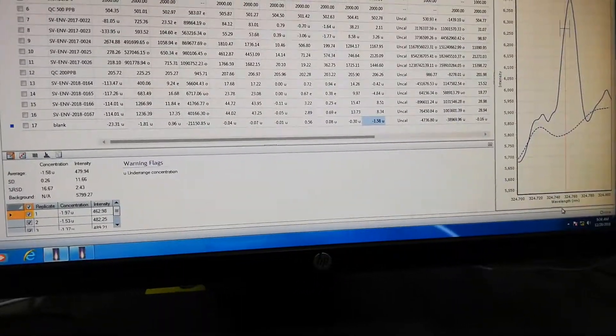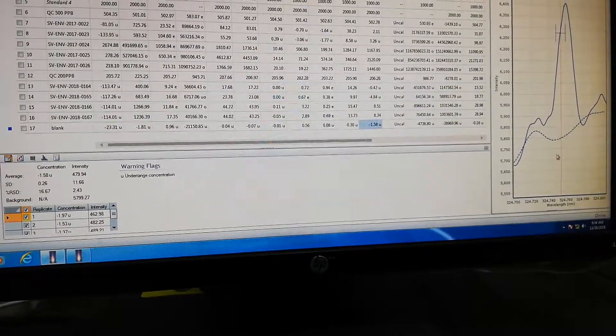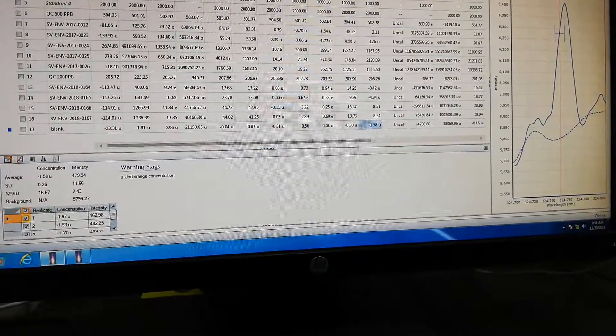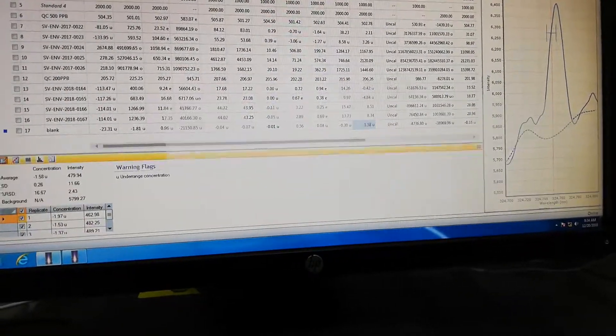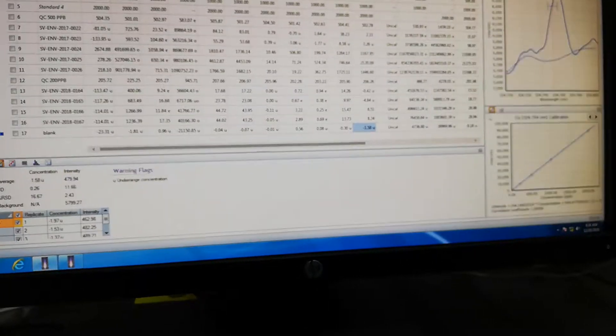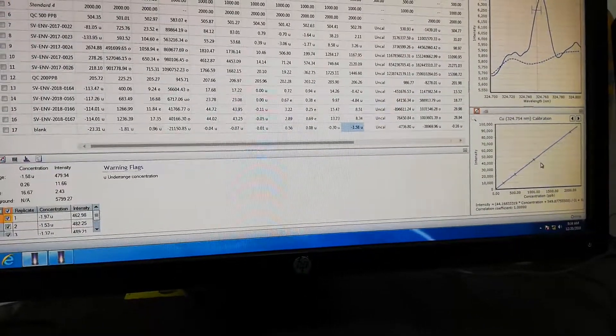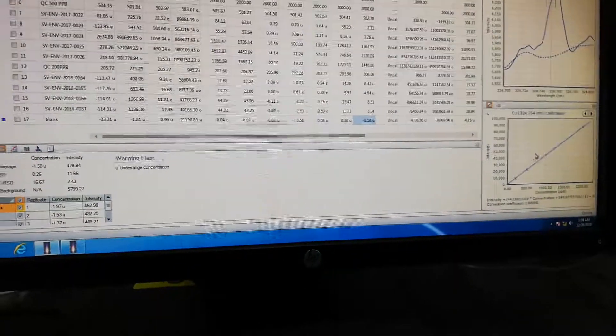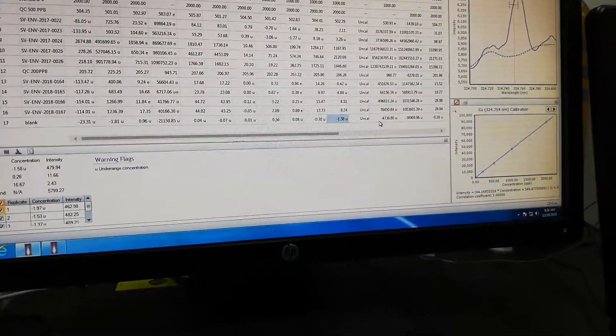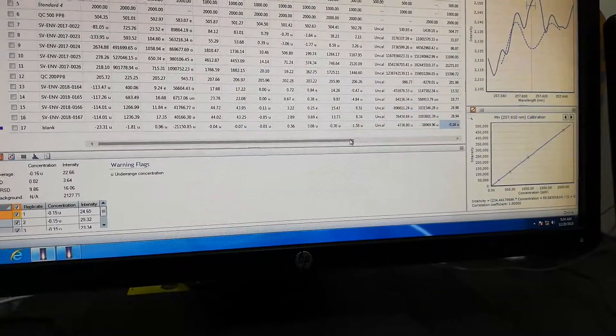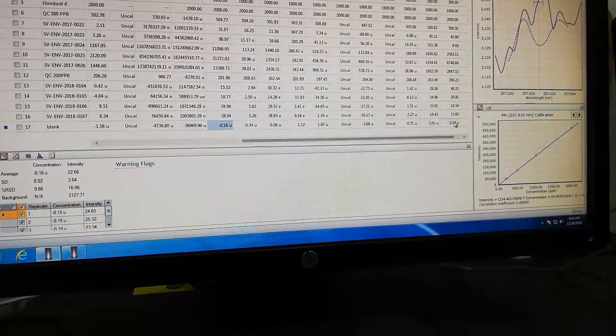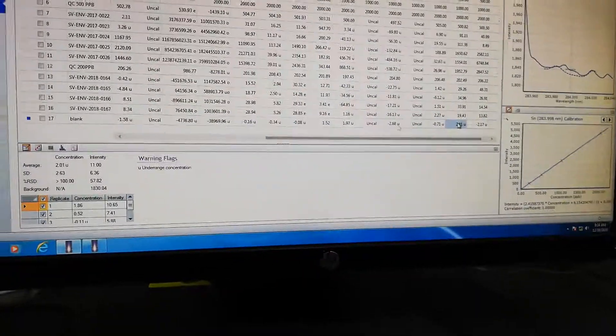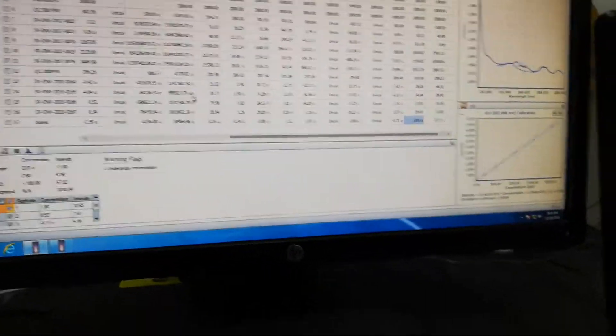You can see the calibration curve. This shows the intensity. These are the simple operations of this software for analysis.